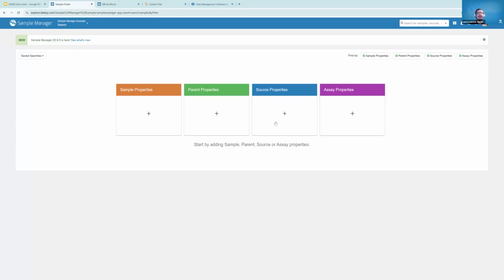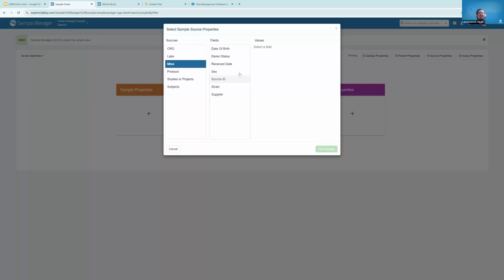all your samples that meet that criteria. So when I was in the lab, I wanted to find all of my samples that came from a potential donor that ended up not donating tissue or organs for whatever reason, because then we needed a discard of them. That process took me months, over a year to do with our system, but with Sample Manager it would have been really fast.